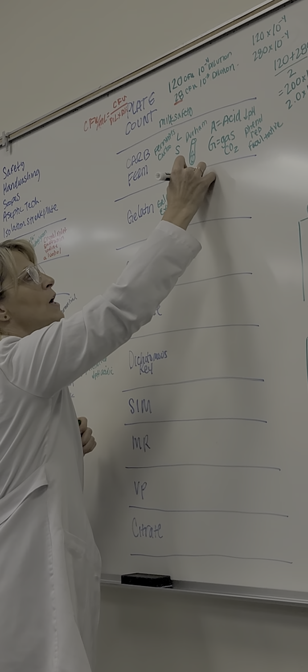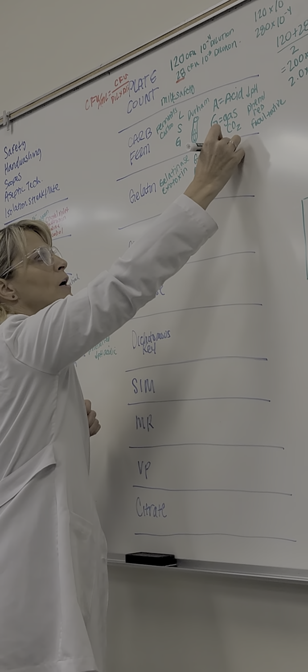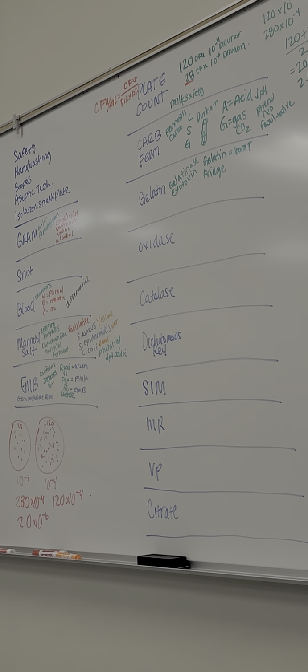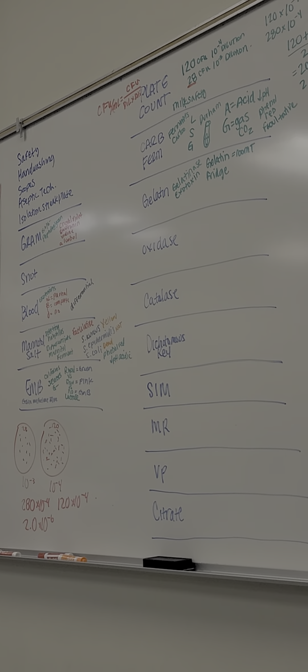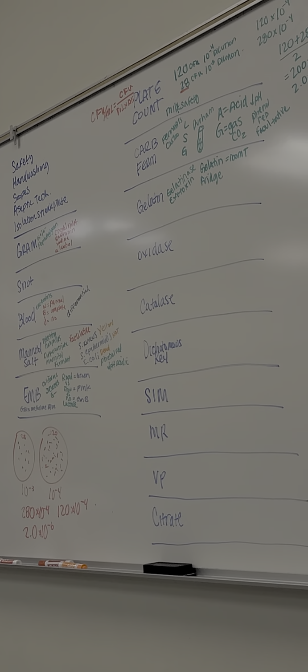Remember, what was funky about this lab? What did we have to do? We had to refrigerate it. Incubation. At what temperature is that one? Is that the 37? 37C is what temperature? Human body temperature. Awesome. So it's about 37 or 98.6.